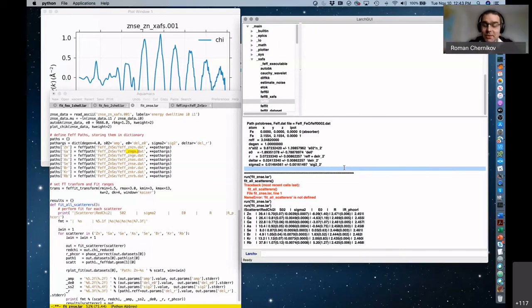Okay, so there's another question about XANES analysis. Usually, if you take the first derivative of the XANES spectrum, all the features are more pronounced in the derivative. Isn't it better to use the derivative for fitting and fingerprinting?